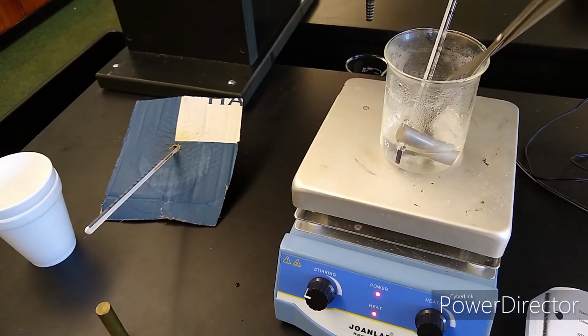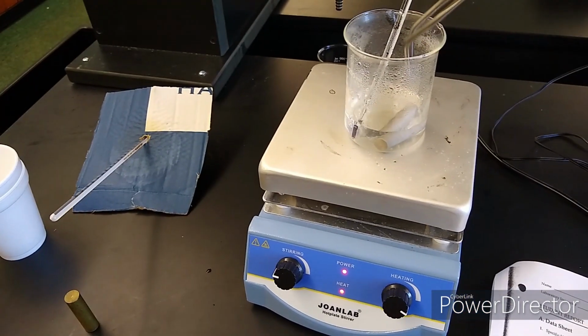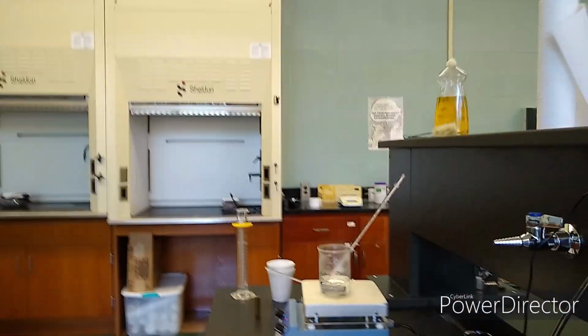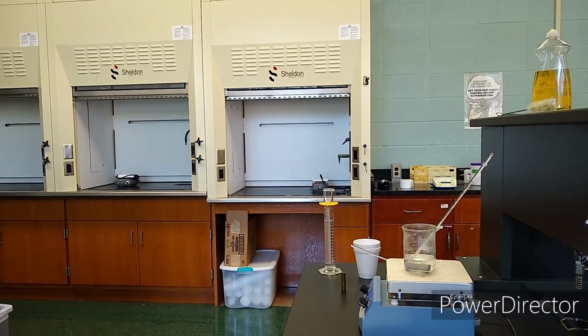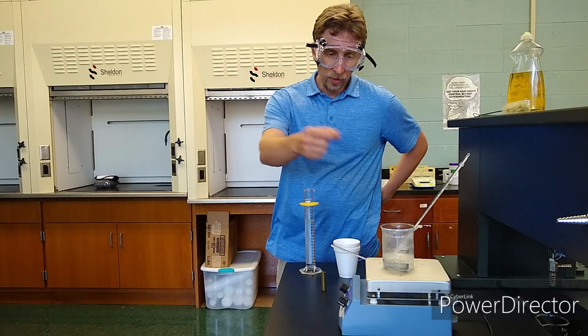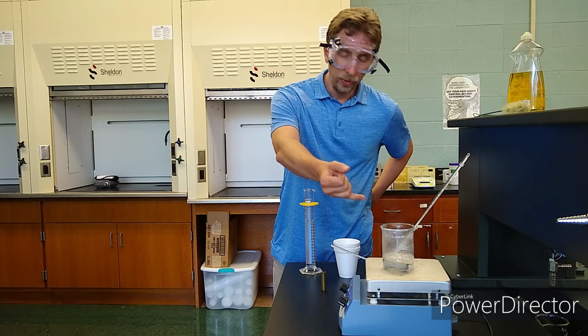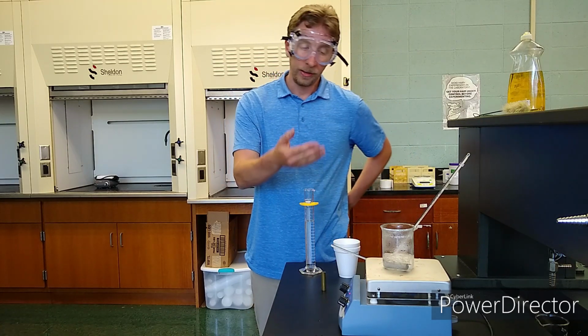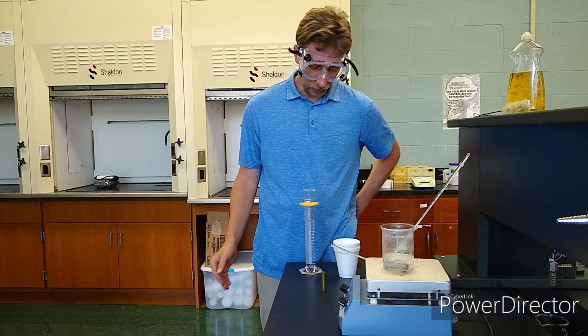Now, it needs to come to equilibrium at 100 degrees so that we will know the temperature of the hot metal, right? Because that's what we need for the calculation, is the temperature of the hot metal. Well, the metal is now in equilibrium with this boiling hot water. And the water is at 100 degrees Celsius, so we know the metal is at 100 degrees Celsius.